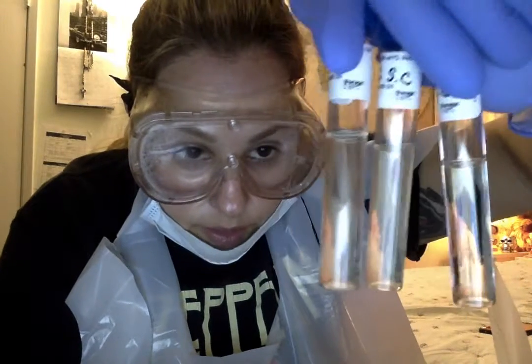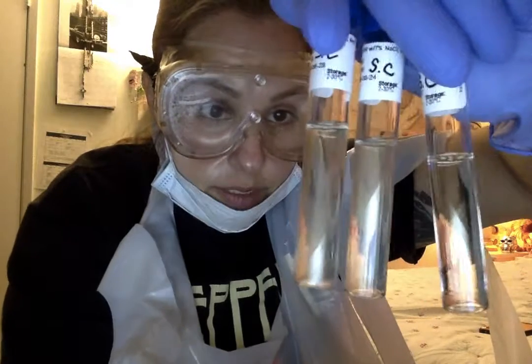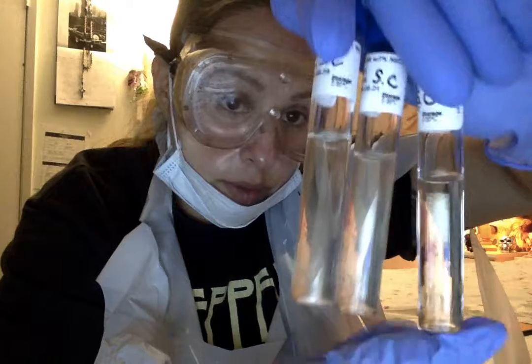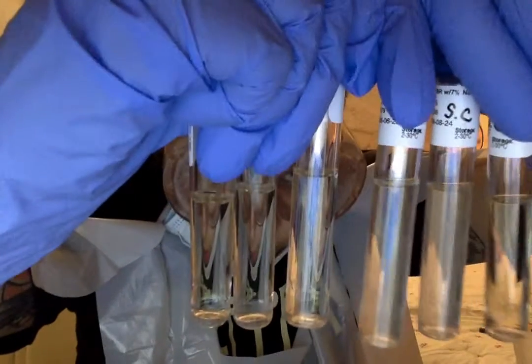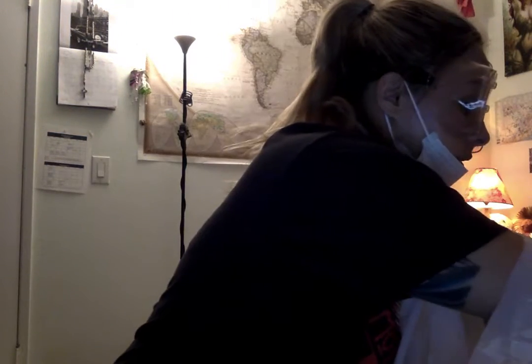So this is why I wanted to do them all together, because you can see the turbidity a little bit better. These two definitely tested positive for microbial growth. The 15% not so much. But if we compare them all together, there we go. You can definitely see there's a little bit more cloudiness in these two here. So that was the first part.